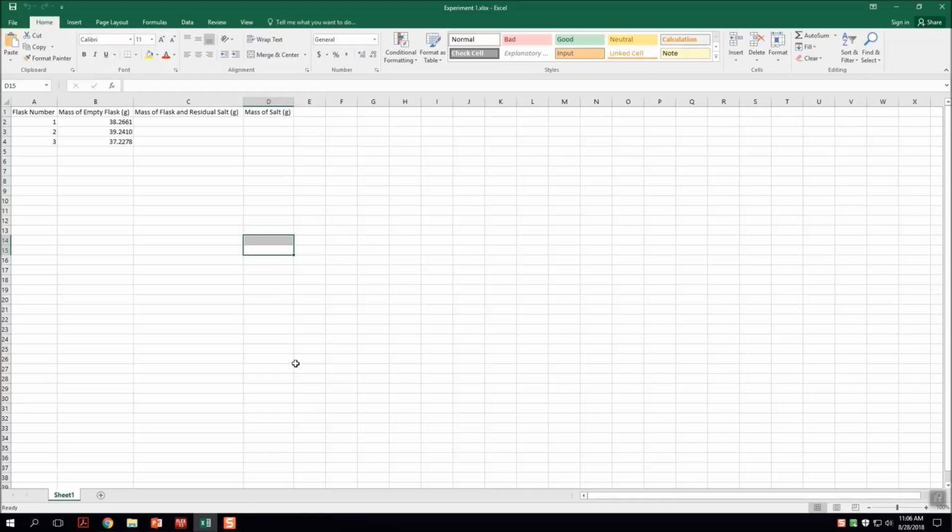All right, so what do we have here? You could pause this video and you could copy this right down into your own Excel file if you wanted to. We have flask number. We're going to use 3 flasks. These are the 50 milliliter Erlenmeyer flasks, the little ones. We have the mass of the empty flask in grams.